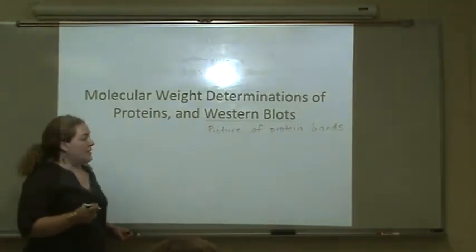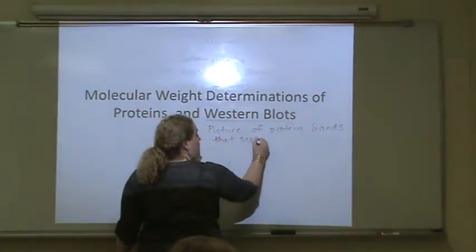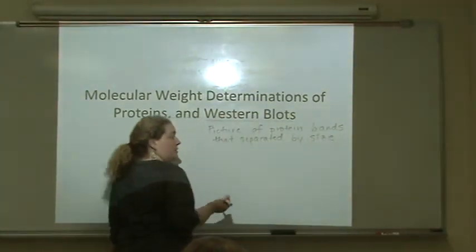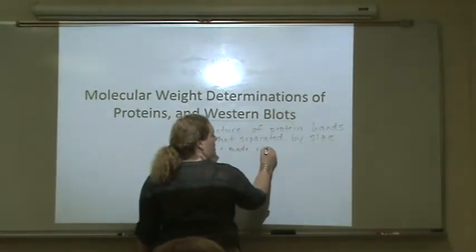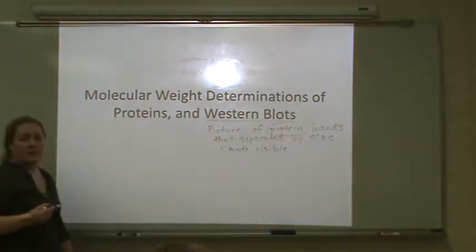Western blot indicates protein, and those protein bands were separated by size and then made visible. So if you hear the term Western blot, that is a protein technique.